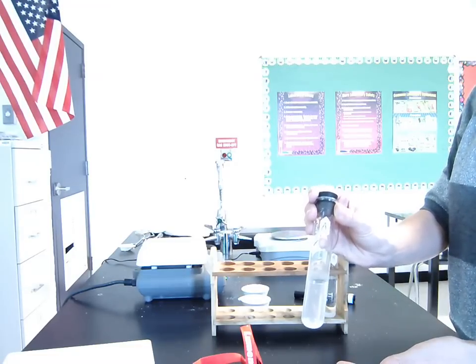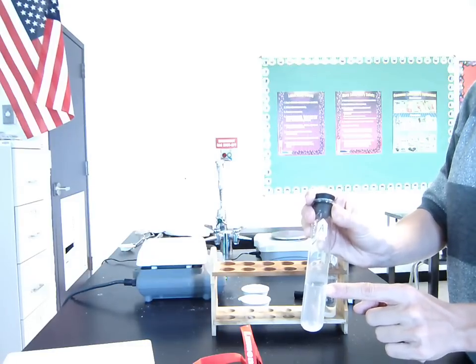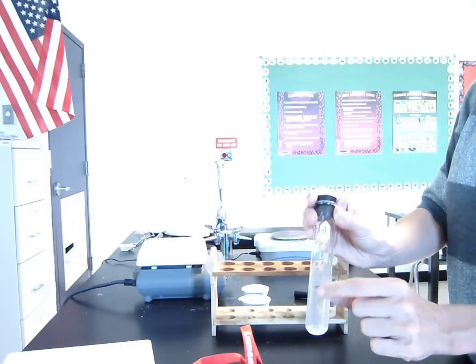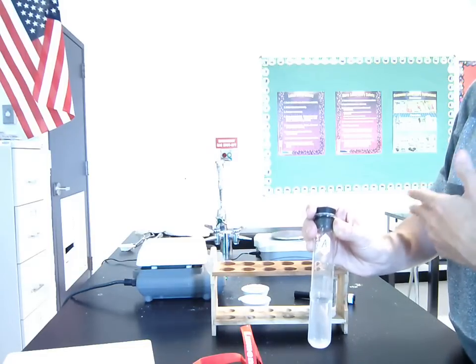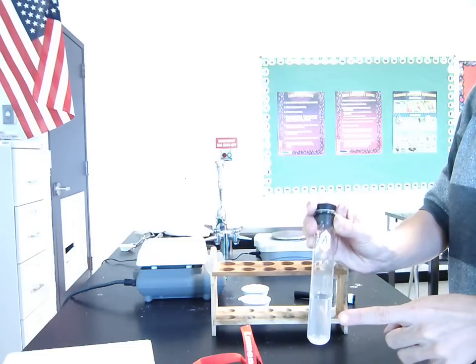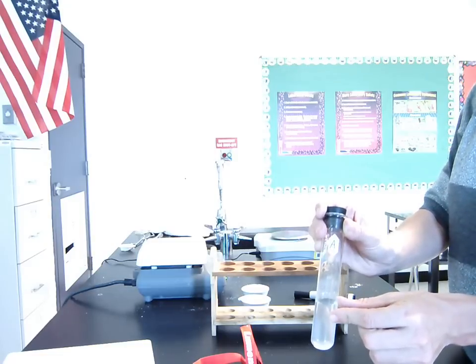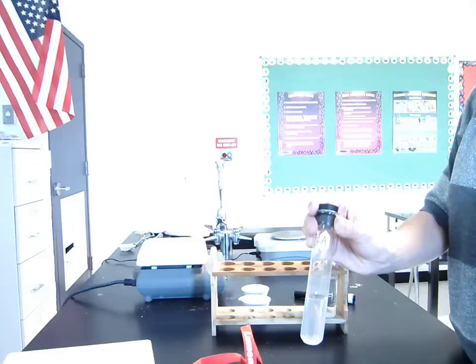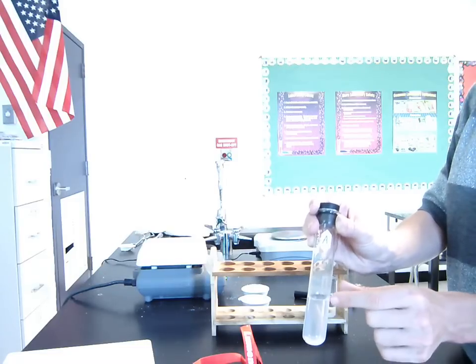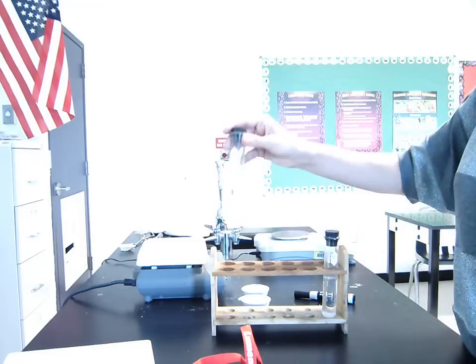And then from there it's just a proportion. If I figure out how much solid dissolves in one portion of this, then I can figure out how much dissolves in 100 cubic centimeters, which is what the concentration is. So all of that to say, we're just going to use a small portion of this. We don't have to use all of it because the solid distributes itself evenly throughout. So a small portion will give us exactly what we need. So we're going to start with a small portion of it.